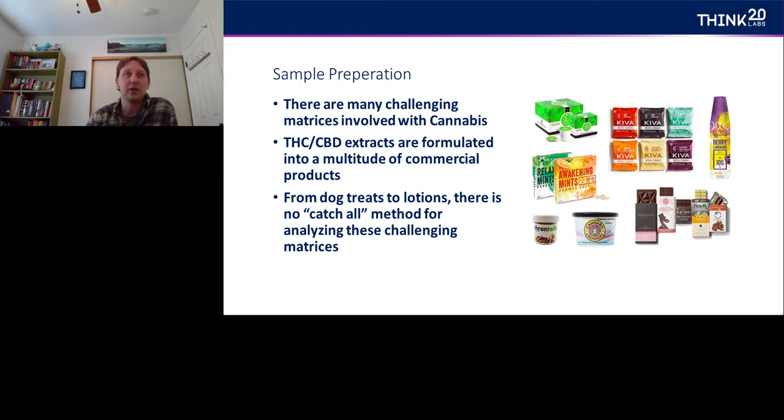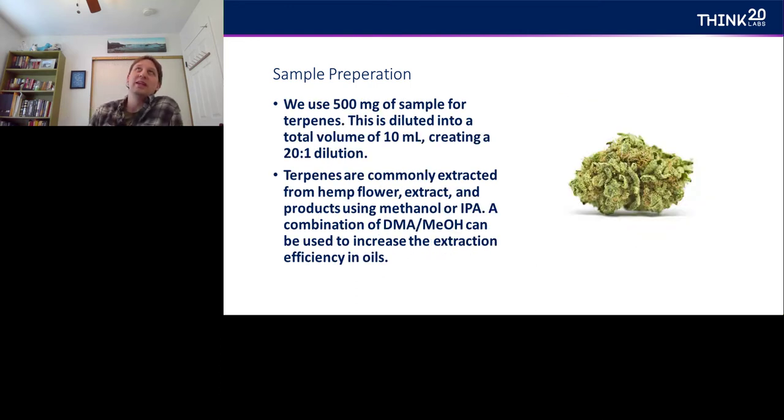There's a term in analytical chemistry called a matrix effect. So this is sort of everything but the target analyte that you're looking for, which in this case are terpenes, and their interactions with your ability to measure them. So sometimes this can amplify, give you a false increase in values, or it can diminish the response from the instrument and you get artificially lower values. So sometimes it takes us a little bit longer to get right on point with some of these analyses.